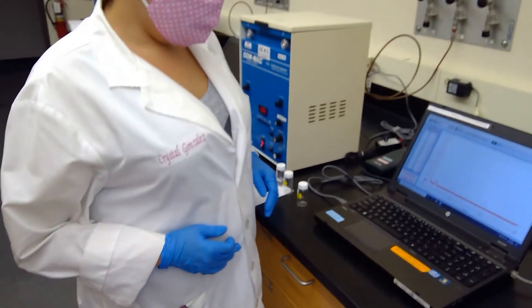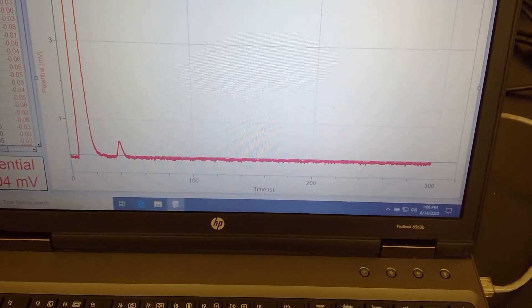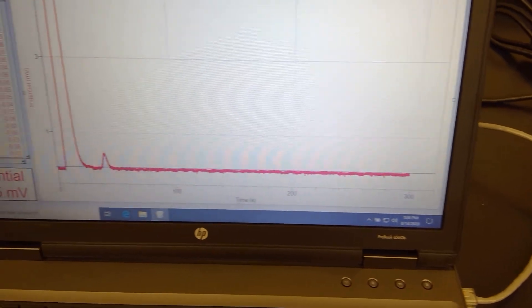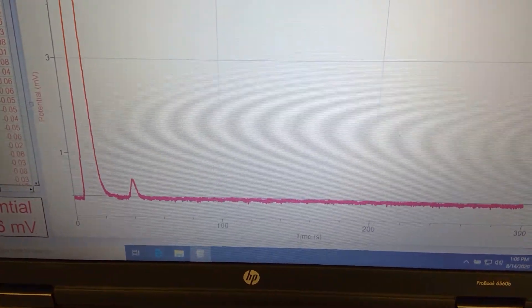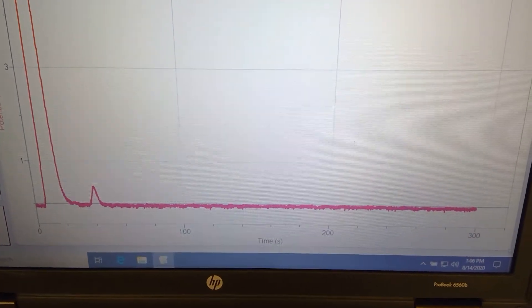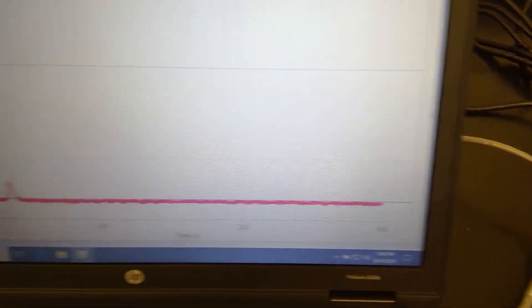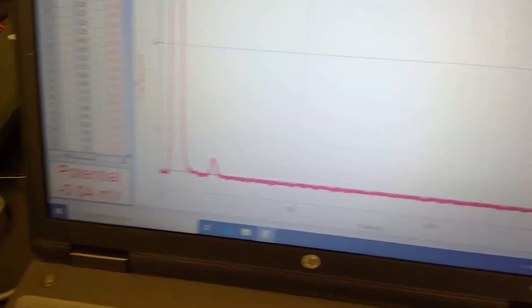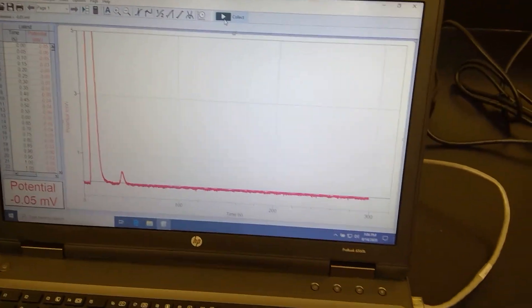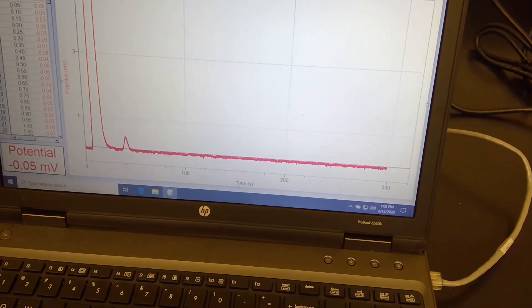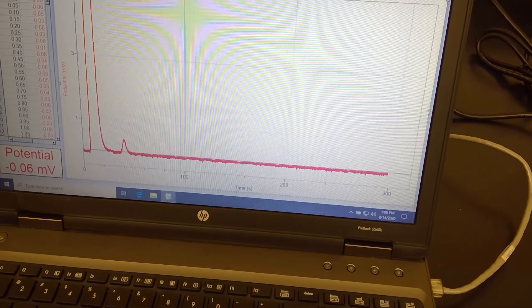All right. So we are here at the end of the run for fraction one for the caraway oil. And as you can see at the 200 to 222 second mark, we've seen no carvone. So this means that so far our column is successful in separation of limonene and carvone in the caraway oil. We're going to analyze fraction five next in a future video.